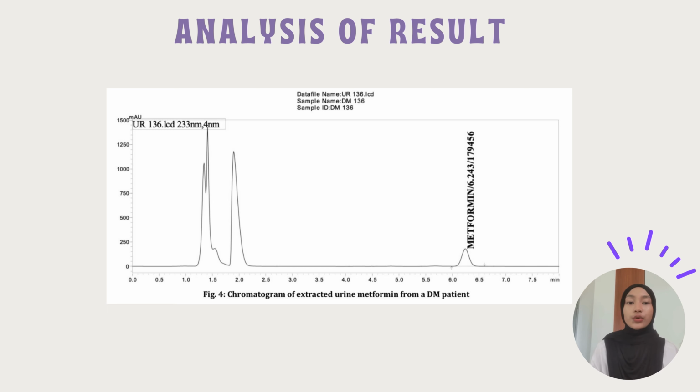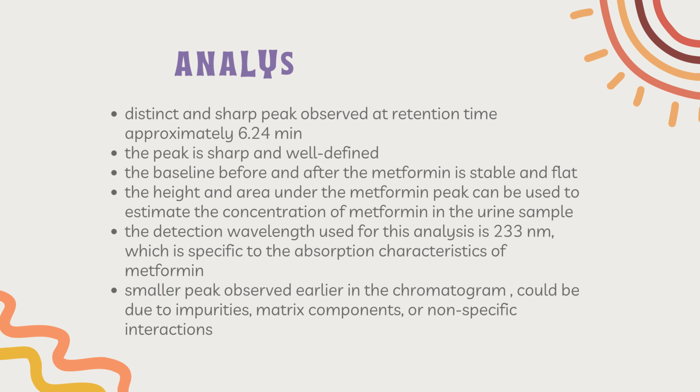And a smaller peak is observed earlier in the chromatogram, around 1.3 minutes, which could be due to impurities, matrix components, or non-specific interactions. However, it is well separated from the metformin peak and does not interfere with its detection.